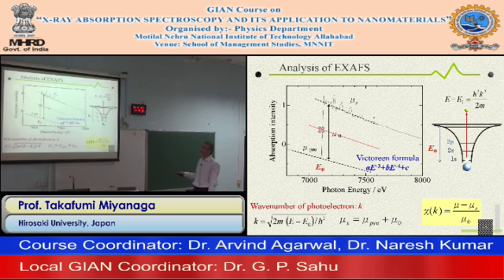It depends on the energy to the fourth power, no, energy cubed. This is the main part of this background. The B and C terms are very small. So before that, our X-ray spectrum is defined by these formulas: mu over mu0 minus 1. The mu-s and mu0 are sometimes the same after the subtraction of the background. The pre-edge should be neglected.